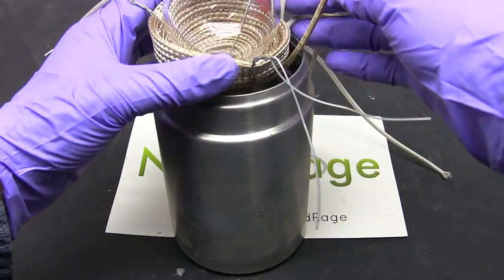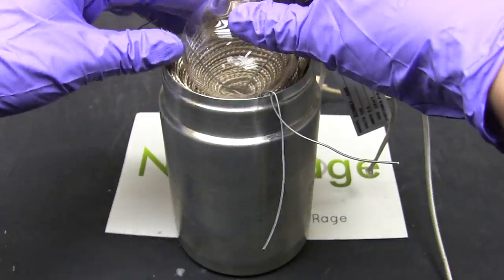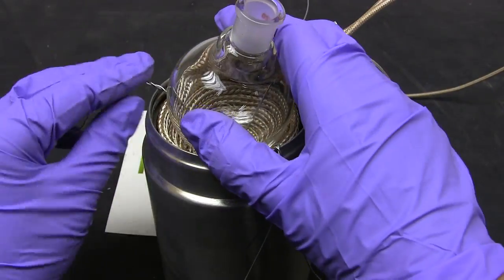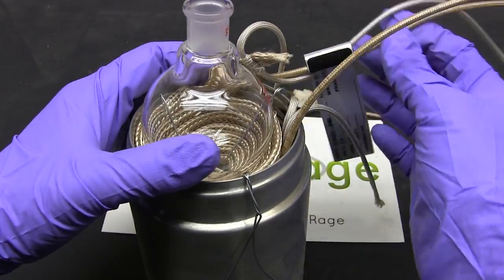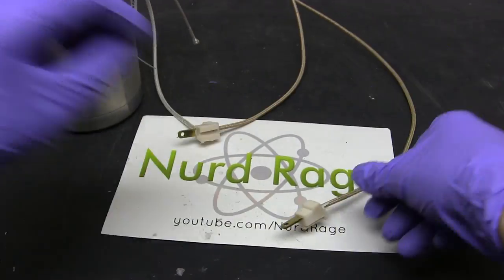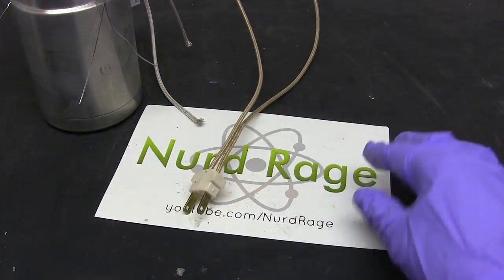Now place the assembly in a steel thermos for thermal insulation. Bend over the iron wires as they will support the heating tape. And there you have it, a basic heating mantle. Just assemble the power prongs and this is ready for use.